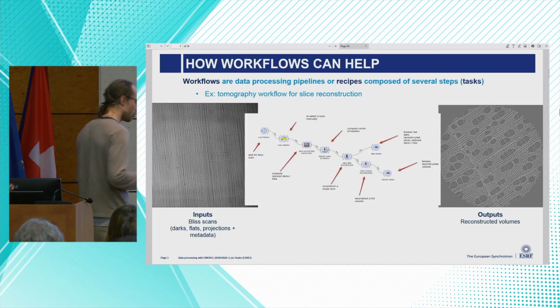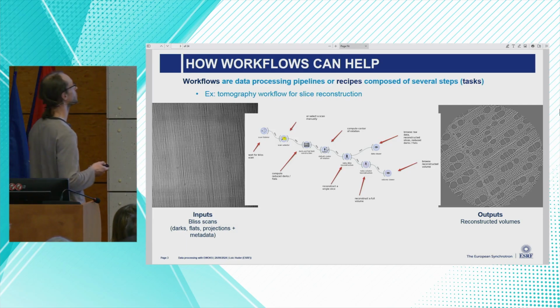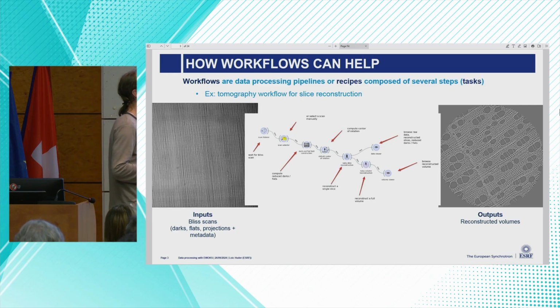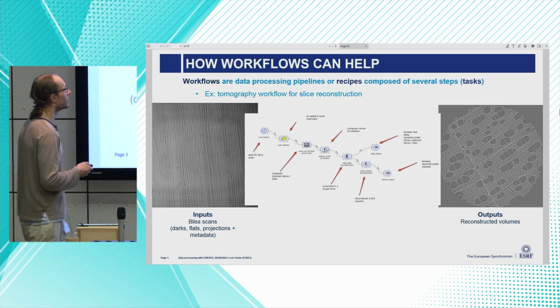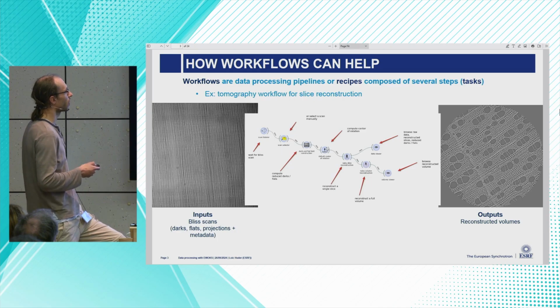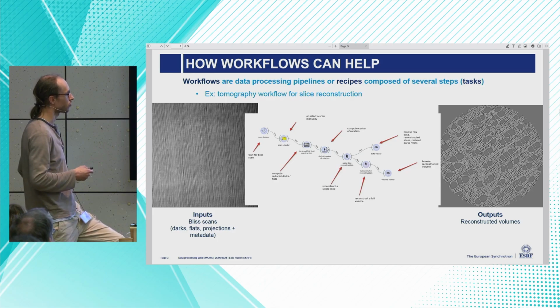And workflows can help. You probably know what workflows are, but just so we are on the same page, I'll remind you of the definition that I've chosen here: workflows are data processing pipelines or recipes that are composed of several steps or tasks. You can see here an example of a tomography workflow that we use at ESRF, where you have a bunch of tasks, one after another. You have some tasks to do specific things, such as find center of rotation, another one to do the reconstruction.